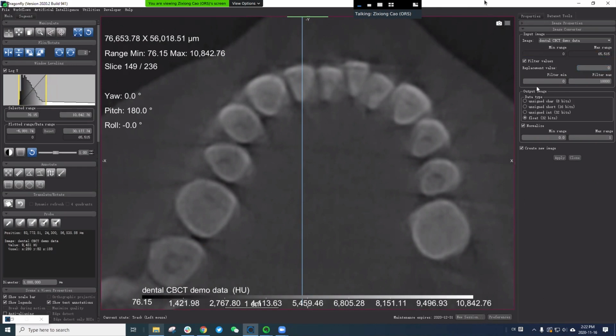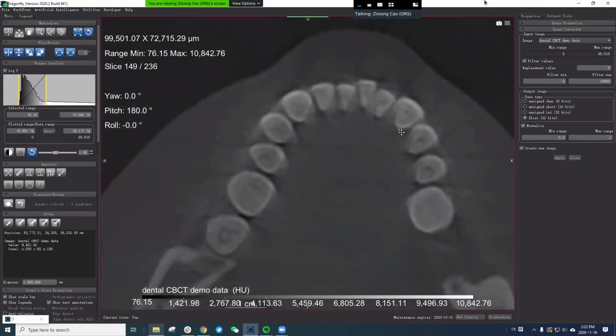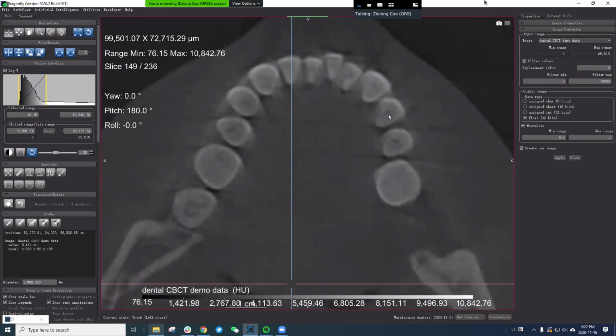We don't have a solution like this for all image sets, so you need to look at your image set and decide what to use here. If your image set is already float, then you are good and you don't need to do this. If your image set has a well spread histogram, you probably don't need to do this either.